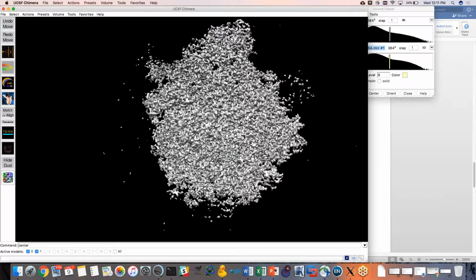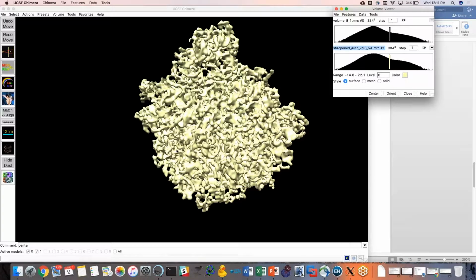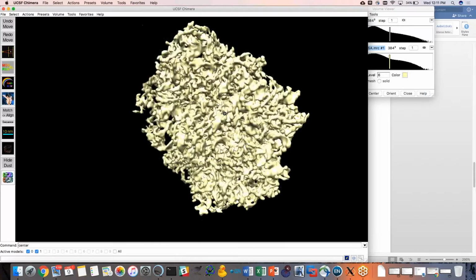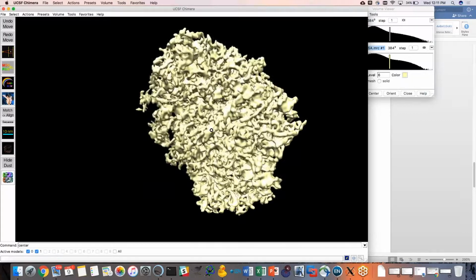All right. So bonus points to anybody who really knows their large ribosomal subunit and can tell me what's wrong, or knows RNA and nucleic acids really well. Somebody who can point out what's wrong with this structure that Chimera's system just spit out automatically for us.